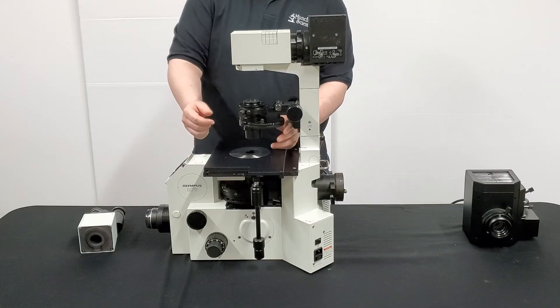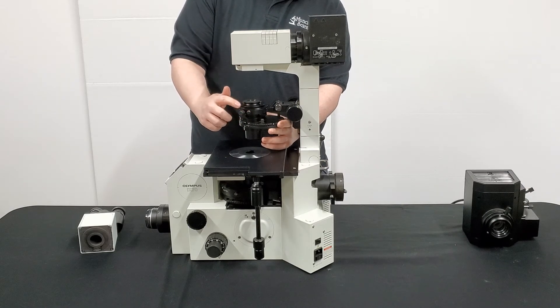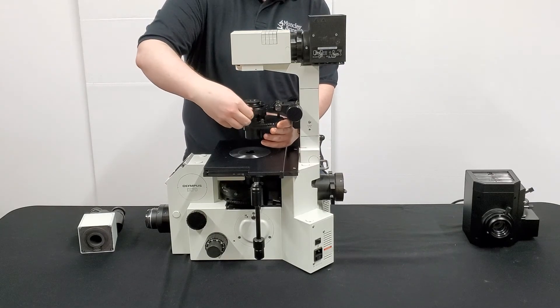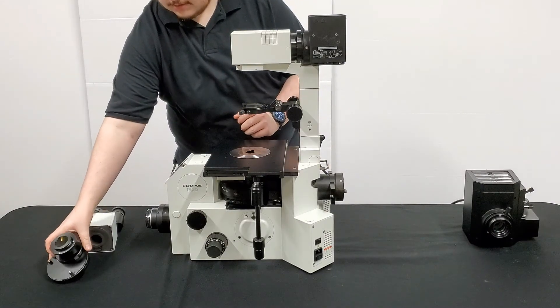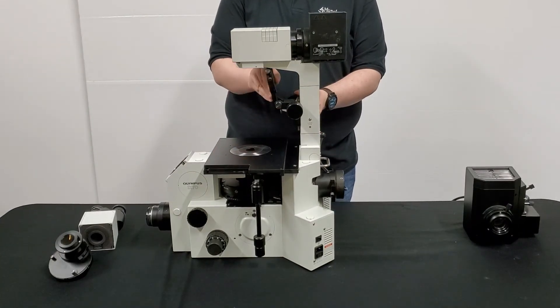Now we're going to go ahead and remove the condenser. Be sure to support from the bottom and then locate this screw right here. You'll notice there's the two adjustment screws and then there's this third smaller screw — that's the one you want to loosen. Give that a few turns to loosen the condenser and slide forward gently to remove. Place it to the side. Go ahead and flip the bracket up if you'd like to get it out of the way.